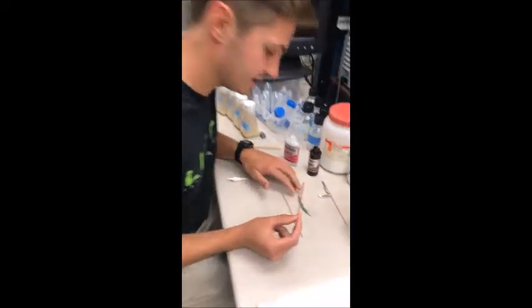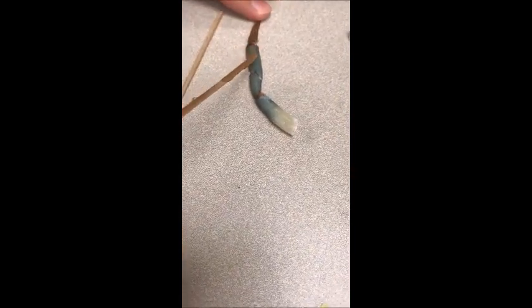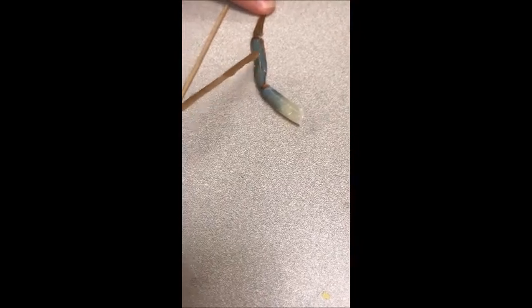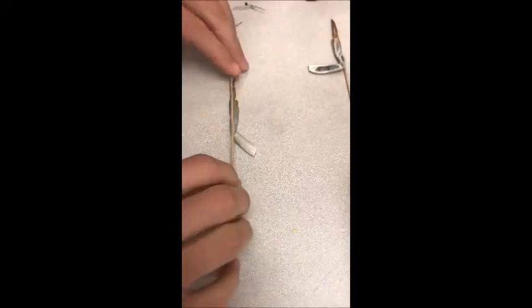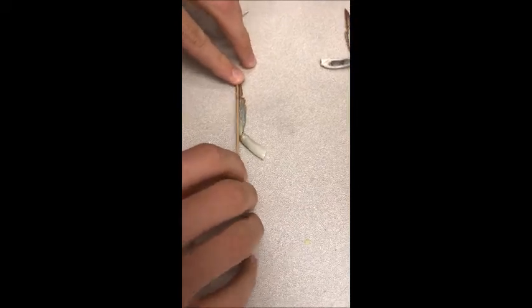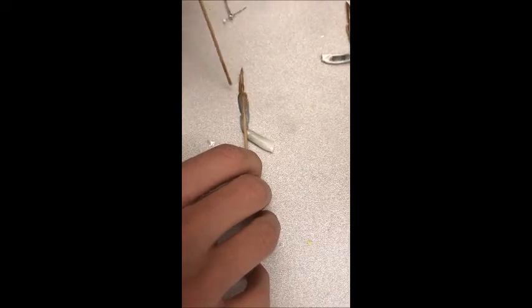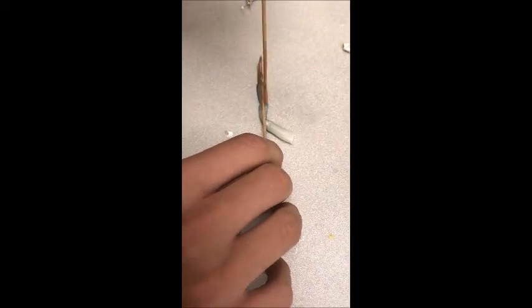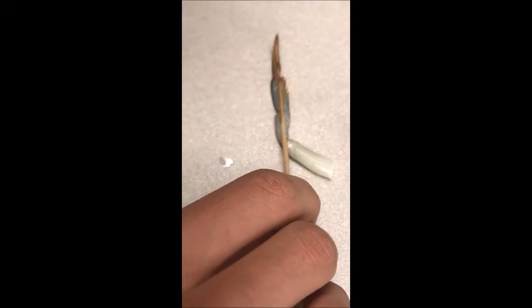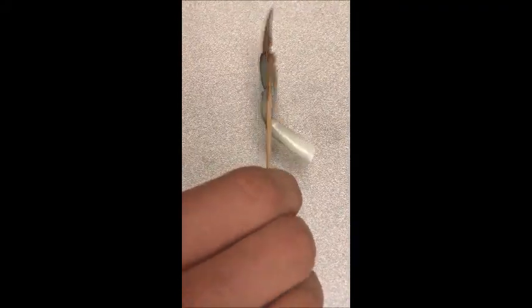Attach the single leg to the stick. And this is better with 2 people, but you'll put a little glue on this side here. And it's best to do this with an accelerator. It makes the process a little faster. Get the stick, and you'll add your stick here like this, and then you can get the accelerator. Wait a second for it to dry, and then you turn it over.